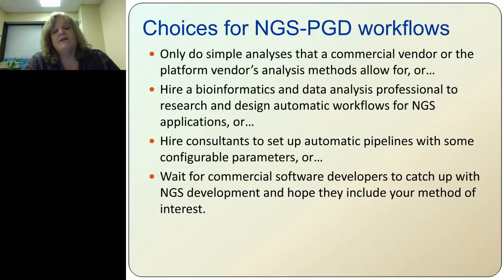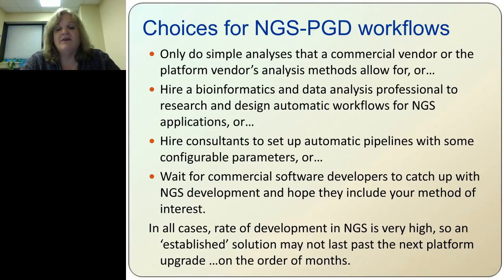Or you can wait for commercial out-of-the-box software developers to catch up with NGS development and hope they include your method of interest, whatever you're interested in. But ultimately, in all cases, the rate of development for NGS is very high. So any established solution you put into place may change, both in the platform being used, or there might be upgrades in data density, bigger chips, more accurate results, and error rates that differ from platform to platform.